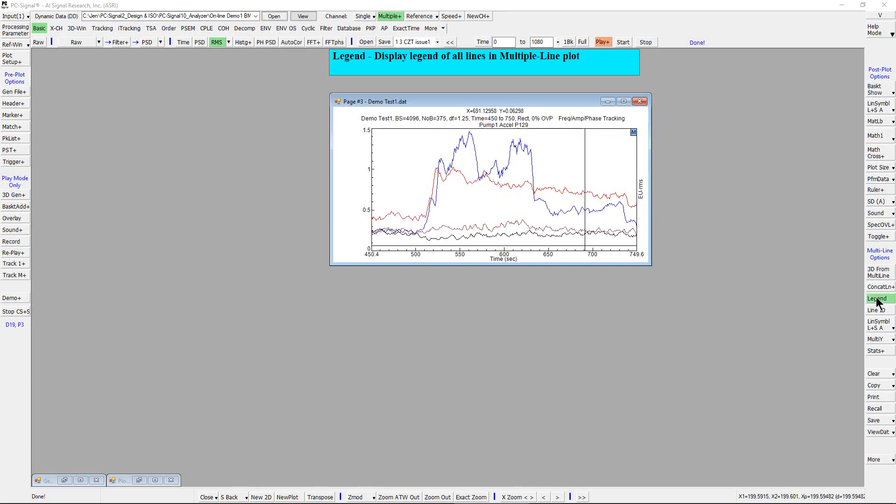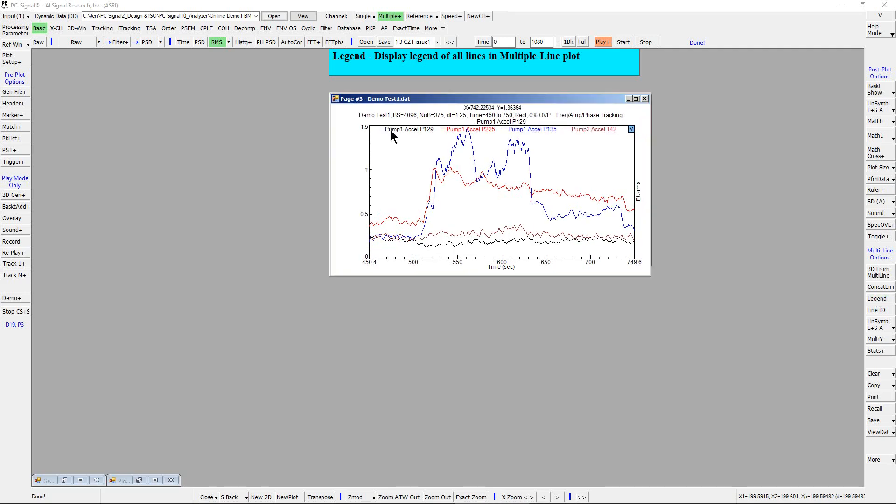Left mouse click on the legend. The legend for each of the four lines will be displayed within the subplot.